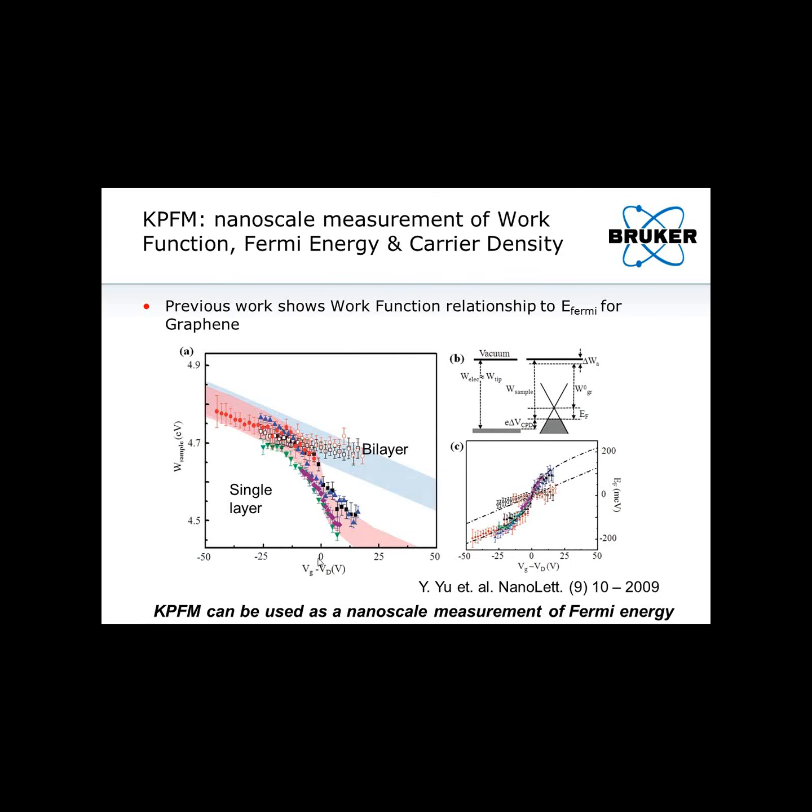As you can see, at a 0 applied gate voltage, they're actually pretty close to intrinsic graphene. You can see that the black and blue are very close to 4.6. Although they don't really stress that in the paper, I think that's very interesting. I think what it suggests is that by simply putting graphene in a controlled environment, you get very close to the intrinsic state of graphene.